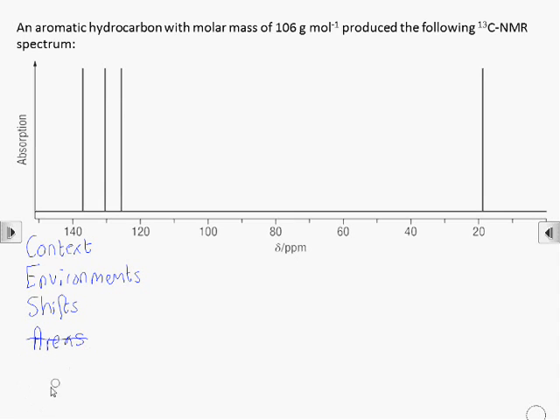The areas of carbon-13 peaks don't tell us anything about the numbers of carbons in those environments, and we don't use splitting patterns in carbon-13. This means we're more reliant on contextual information to help us solve the molecule. In this case, we're told it's an aromatic hydrocarbon and we're given the molar mass.